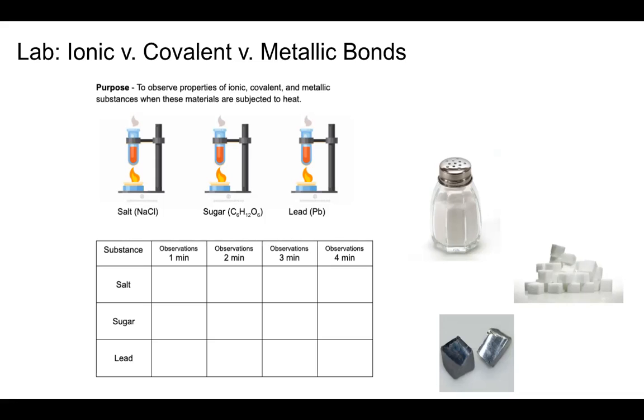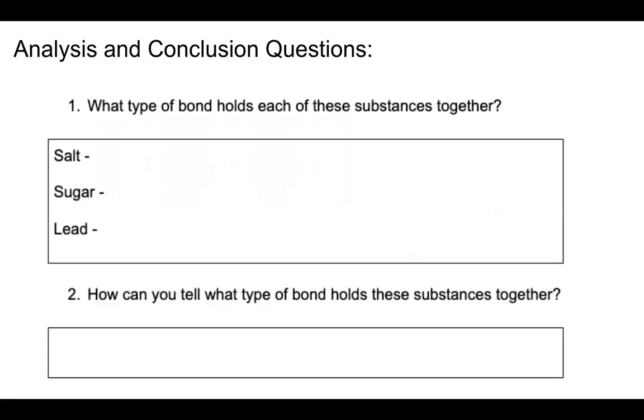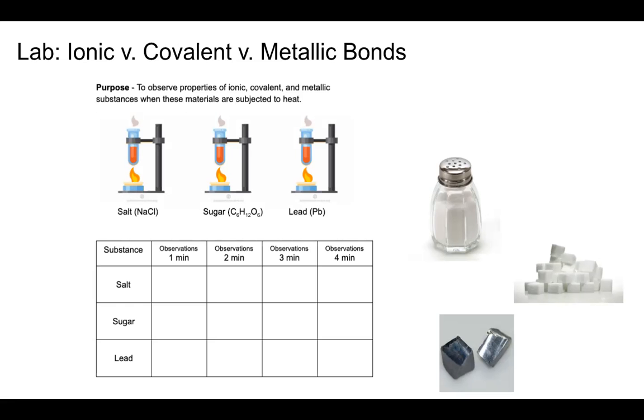We always want to, in science, when we do a lab, we want to keep track of our observations along the way to make sure we are notating that. Once we've done that, we got some analysis and conclusion questions that we'll address, but in the meantime, we just want to fill out our data table.